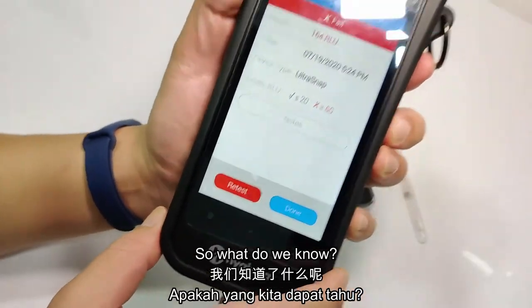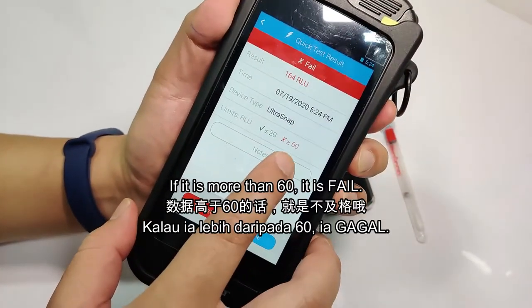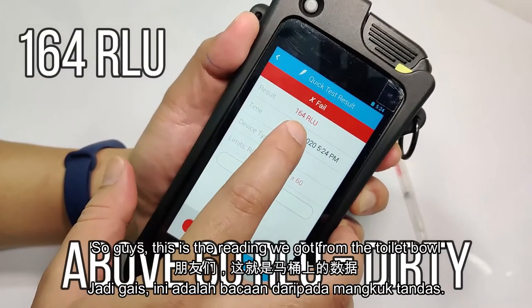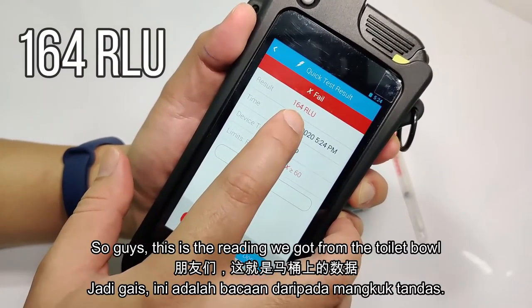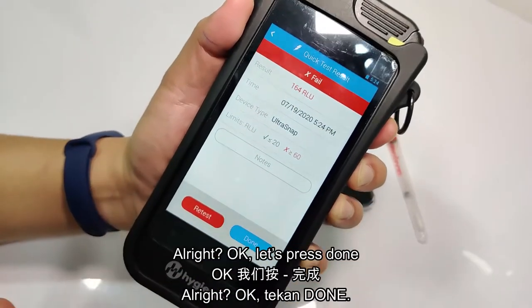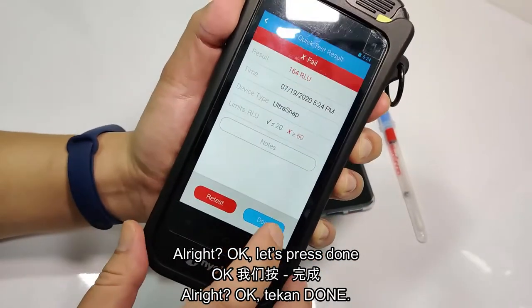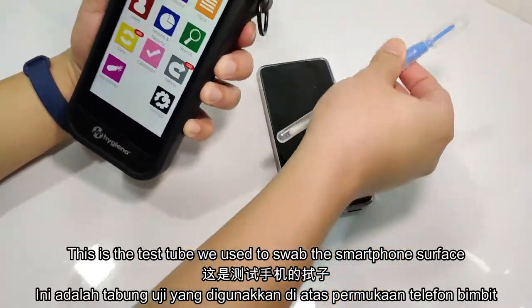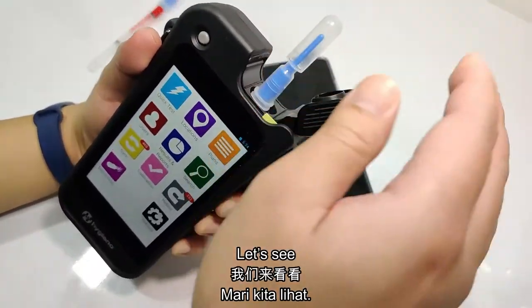Place the test tube inside, close the lid, and we run the test. Okay, so what do we know? If it's more than 60, it is failed. So here it shows — 164. So guys, this is the reading that we got from the toilet bowl. Let's press done. So this is the test tube that we used to swab for the smartphone surface.